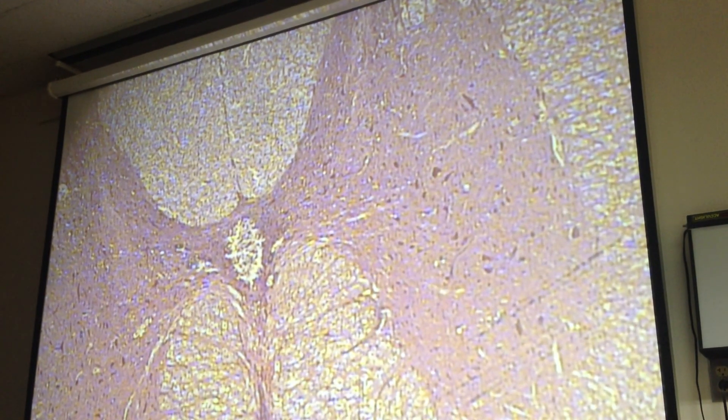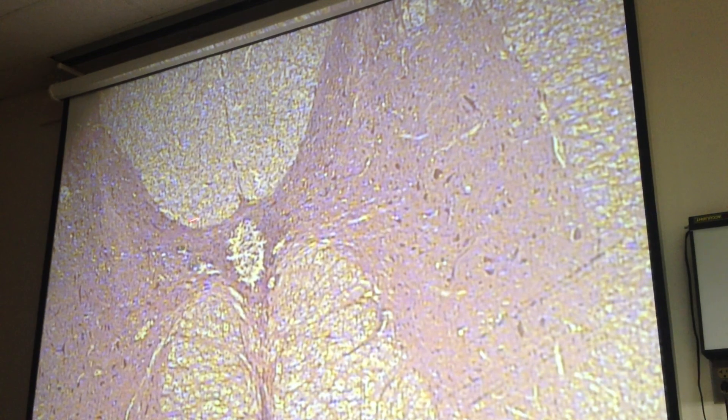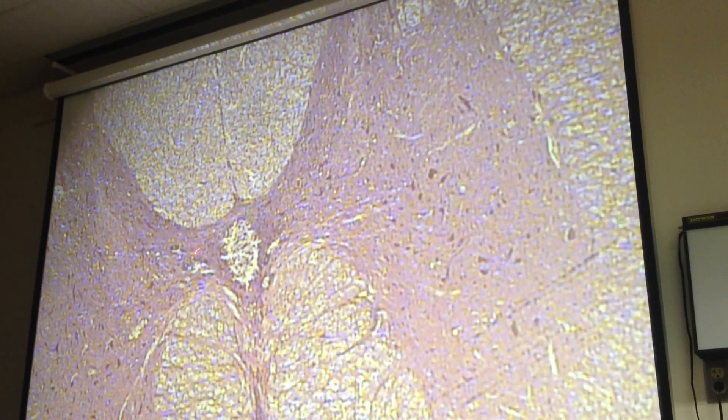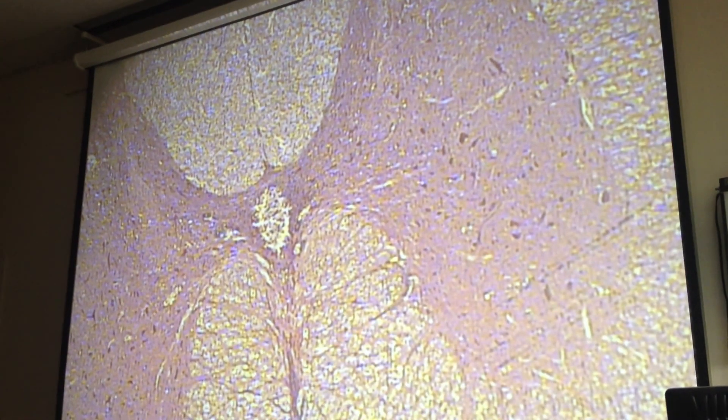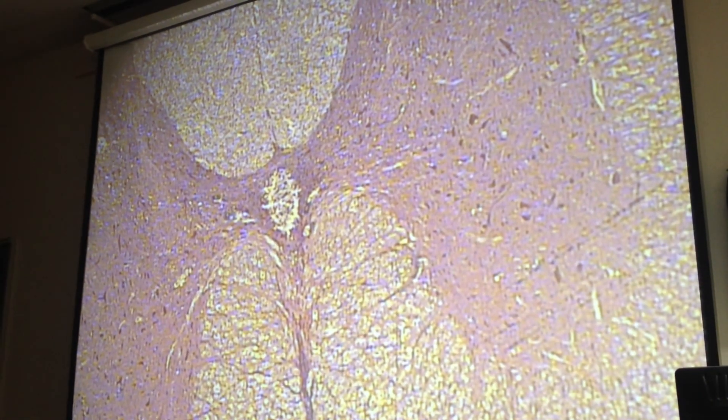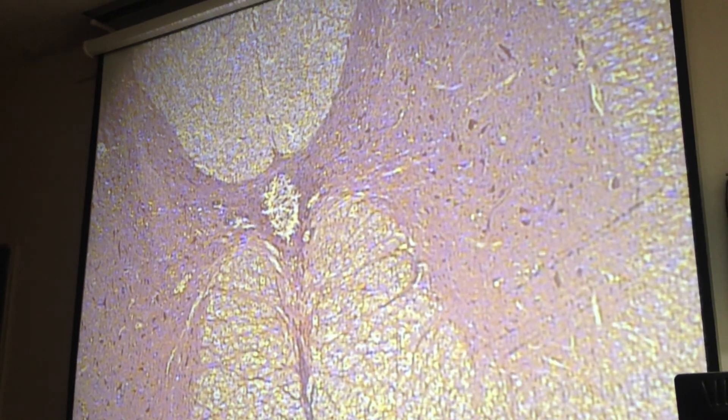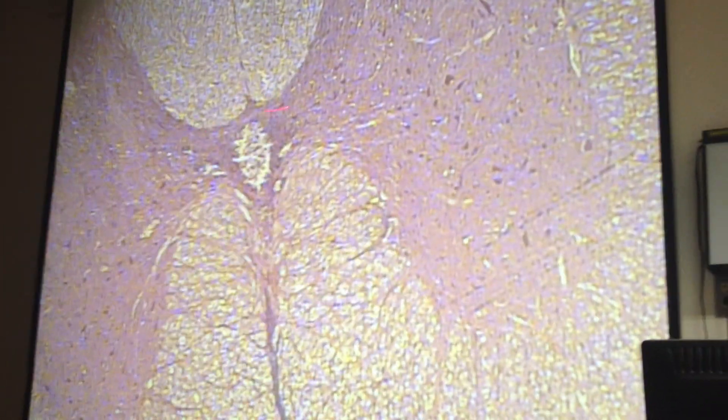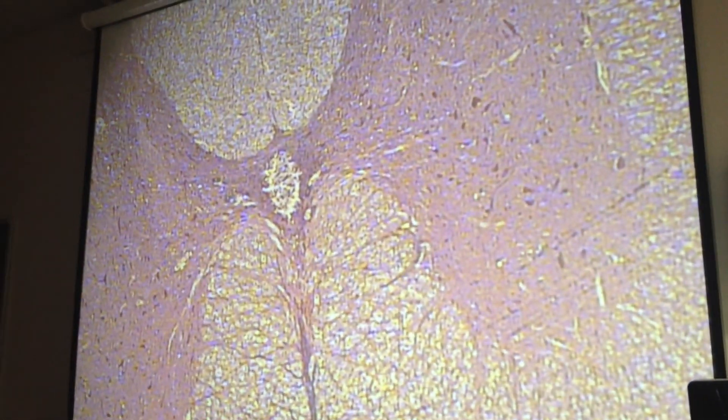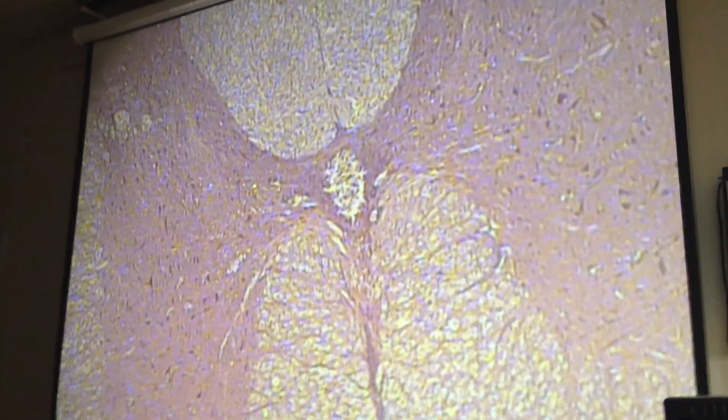And then there's the two gray commissures. So this one is what? Posterior gray commissure. Yeah, so usually gray matter is the somas and the neuroglial cells, but sometimes there's some axons in there, but not so many. So yeah, this is crossing over of axons to communicate with the other side of the spinal cord. But in general, you want to think of gray matter as somas and neuroglial cells. Maybe some unmyelinated axons, but mostly somas and neuroglial cells.